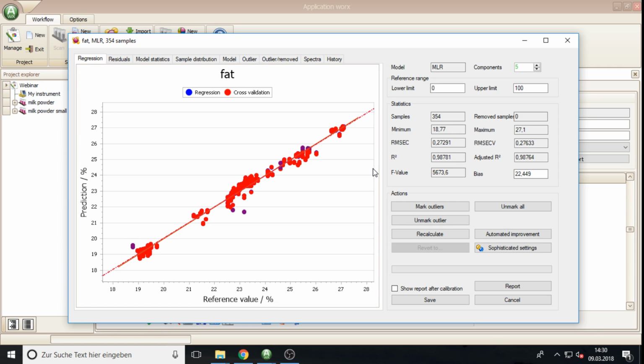And so we go on, and this will be already more than 19 models, because there are several combinations of 2 wavelengths. The first and the second, and third, and so on.